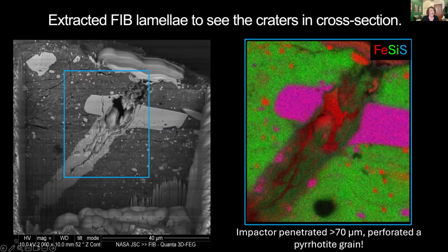Now, this thing penetrated over 70 microns from the surface of the sample, and it was going either fast enough or was strong enough to penetrate this really high density phase, which is an iron sulfide material, basically an iron plate that's sitting in the sample. And this hypervelocity dust impactor penetrated right through that plate, didn't even slow down, and went 70 microns deeper inside the sample.